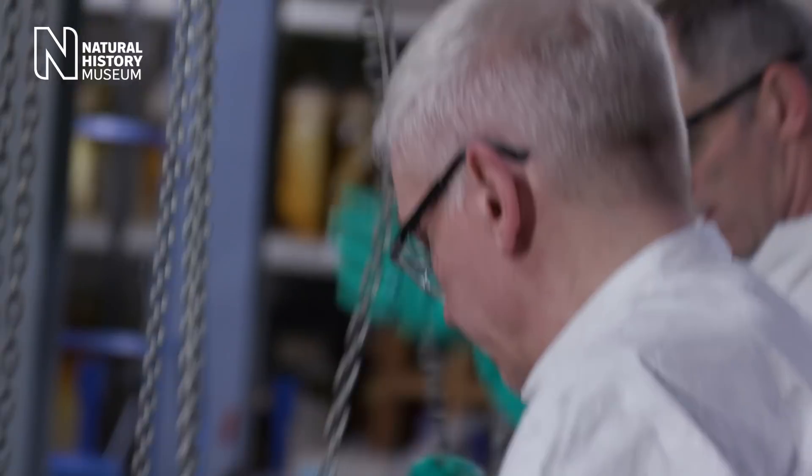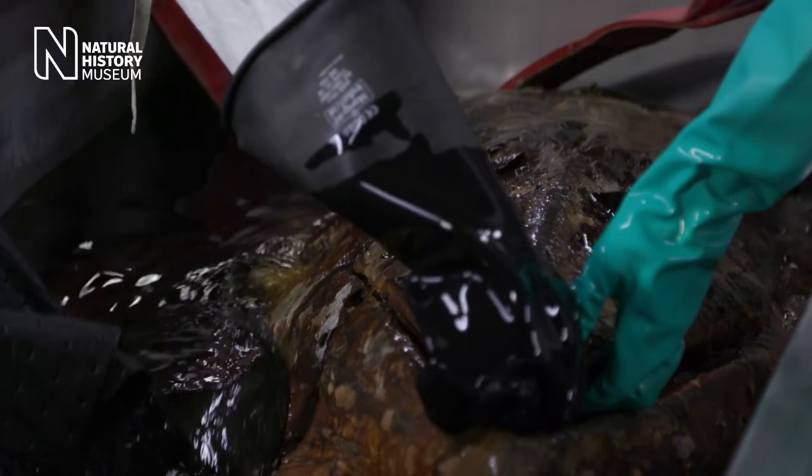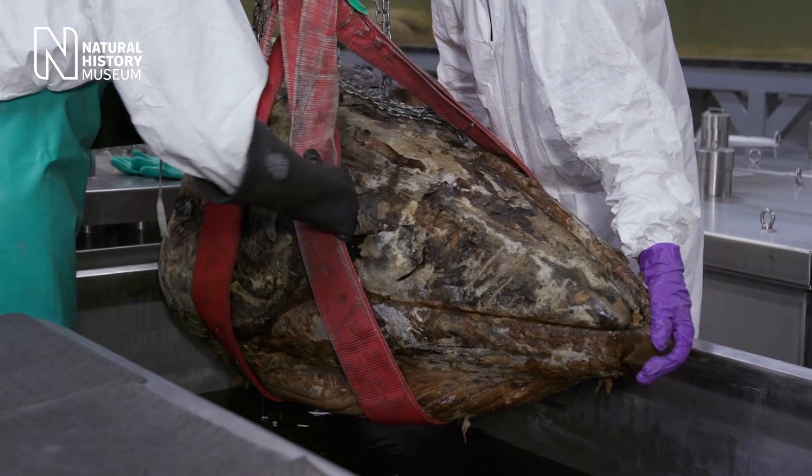Today we're letting two scientists open up the head of a minky whale. It's been in formaldehyde for almost a hundred years and it's quite a rare specimen.